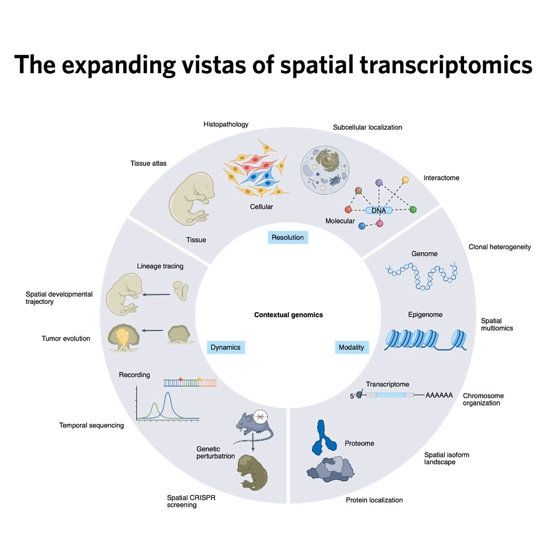The real breakthrough for high multiplexing is combinatorial multiplexing. This is different. Instead of labeling a unique set of genes in each round and then trying to remove those labels completely, here, each individual RNA molecule is interrogated over multiple imaging rounds. Okay. How does that work? Its identity isn't based on just one color in one round. It's decoded based on the combination, essentially a binary code of images or rounds in which it was detected versus not detected. I see.